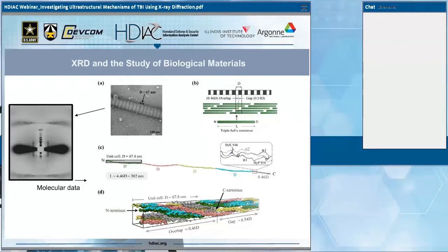that left picture is showing a fiber diffraction diagram. It's a highly ordered tissue, and it's a lot more ordered than the diffraction that we obtain from the neurons in the rest of the study, but it gives a little bit of insight as to how far this can go under the right circumstances. So the diffraction on the left is arising from the fiber, or the collection of fibers of collagen in element A, which contains all of the structure that you see in B, C, and D.